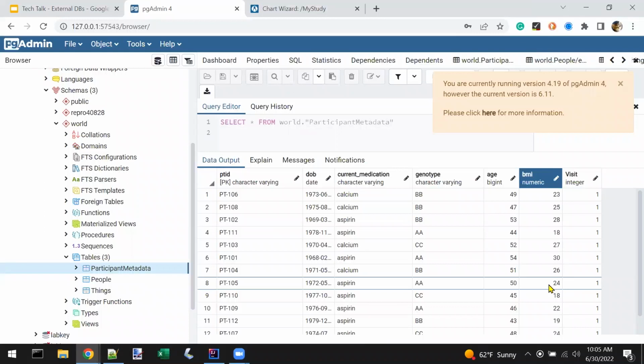You can't change the schema from within the LabKey user interface. Oh, I can't add columns? No, I mean, even like module query schemas, you can't change, you can only change schemas for lists and data sets and sample sets, right? You can't change them for any table. But Adam actually added, I don't know, 2 years ago or something, a very cool feature where you can use our module schema management scripts and have them work with external schemas.